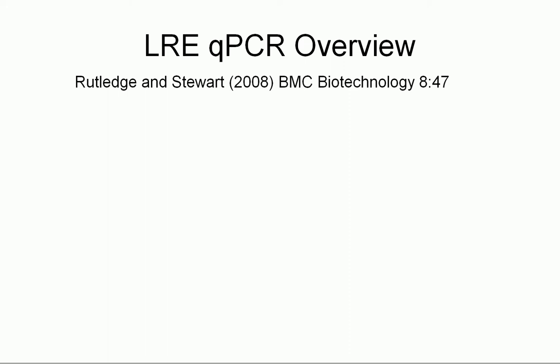In this series of presentations, I will describe how LRE was developed and how it can be used to conduct absolute quantification. I will start by pointing out that our 2008 article in BMC Biotechnology provides a detailed introduction to LRE, along with additional material that will not be covered in this overview.